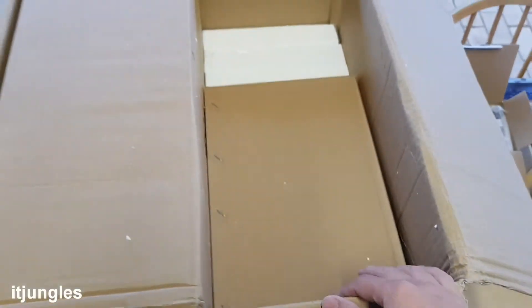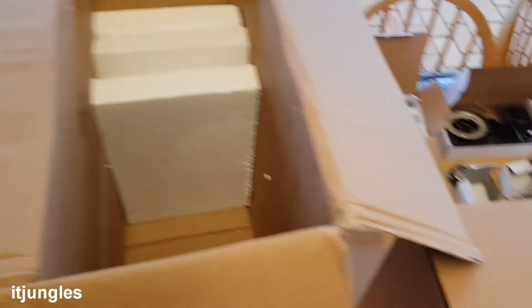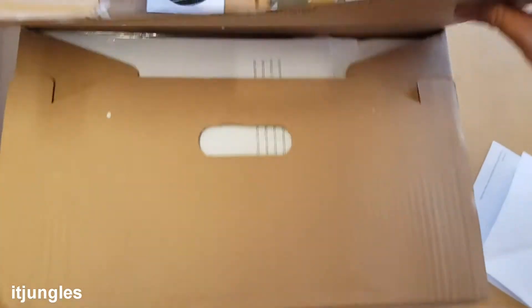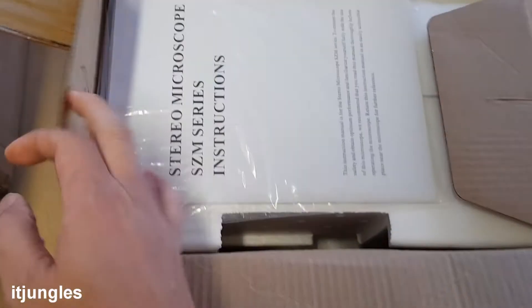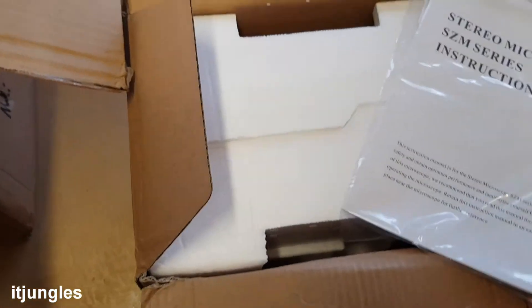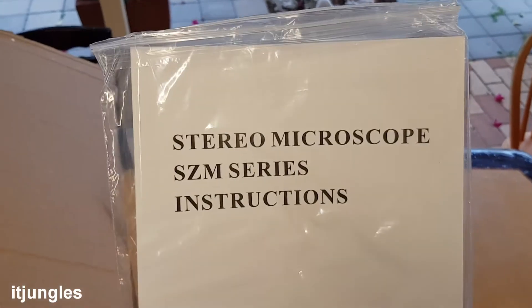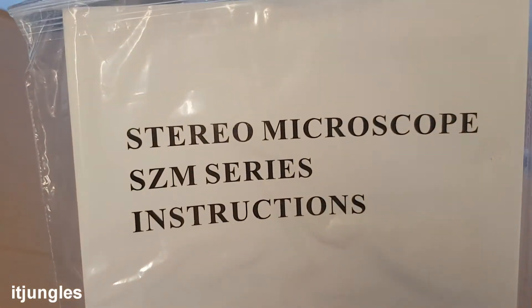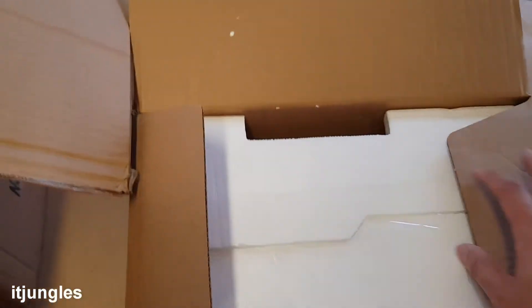That's heavy — we need to drag this one out. Okay, I just lifted the box out. So that's the box right here. It has stereo microscope SZM series instructions inside. We'll need those to put this thing together.